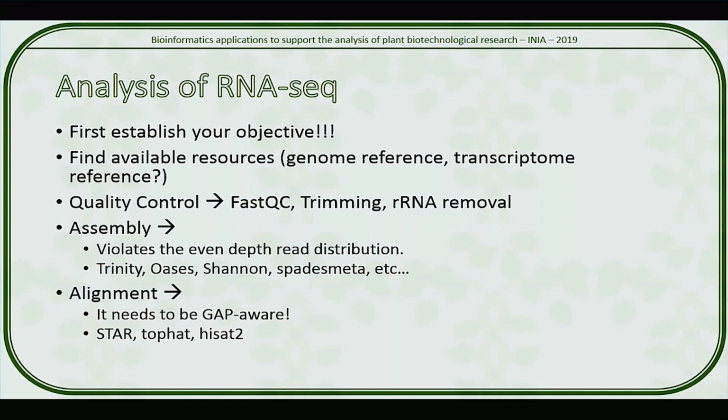Yeah, your statistical analysis does. Have you heard the terms FPKM, RPKM, etc., which are normalization methods for RNA-seq read counts? These are basically methods that have been developed to normalize the data of RNA-seq based on 2 parameters. First is the library size, is how many reads have been produced in this specific library, and second, by gene length. It's how many bases or how long each of the genes is. Of course, for this kind of normalization, you need to know beforehand what's the length of each of the genes that you have sequenced, which sometimes you do, sometimes you don't.